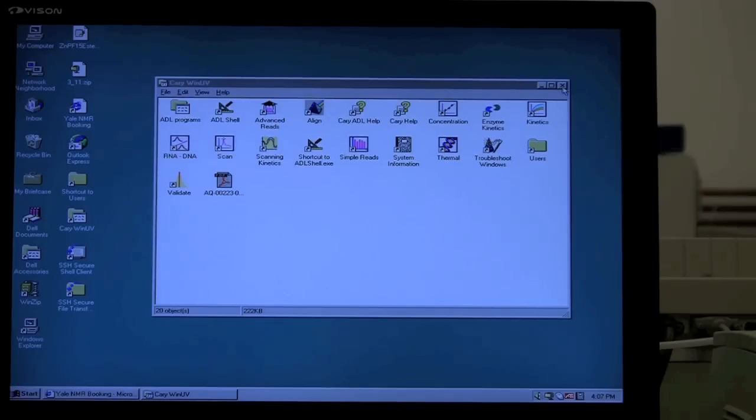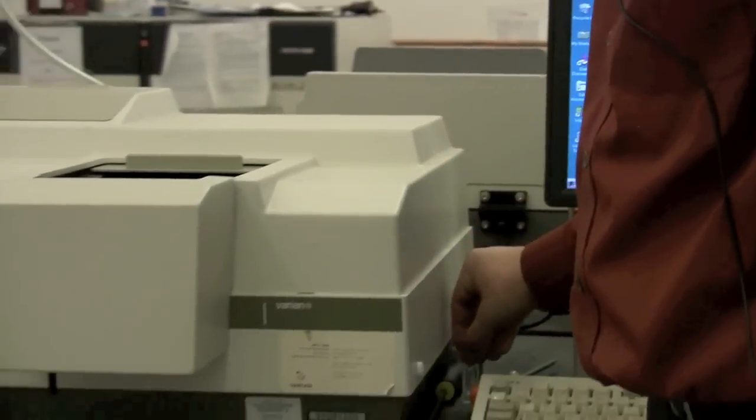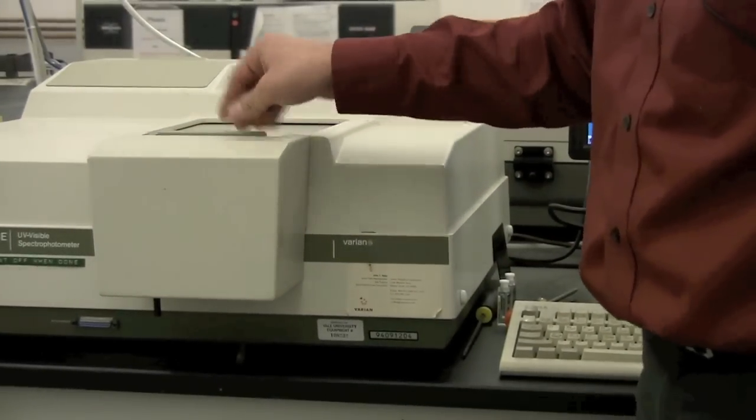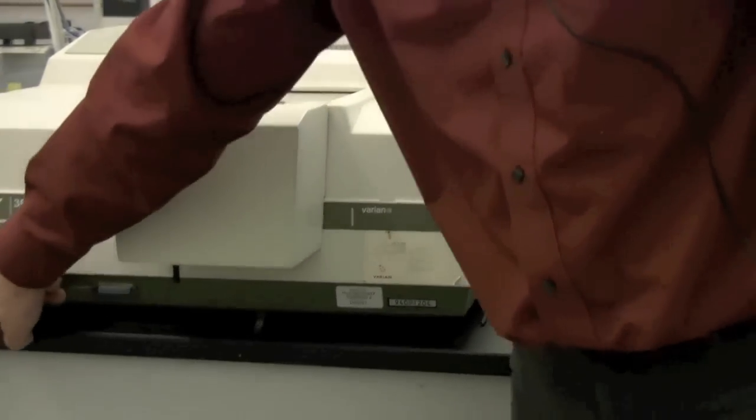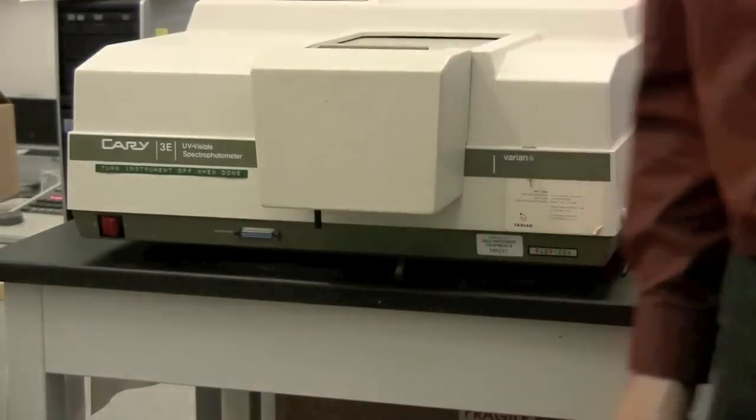When you're finished, you can close the window, take out your sample, and turn off the instrument.